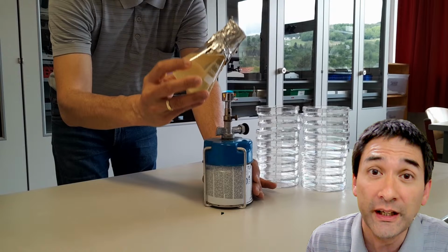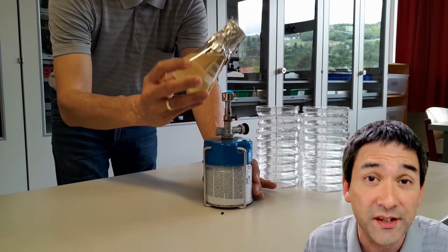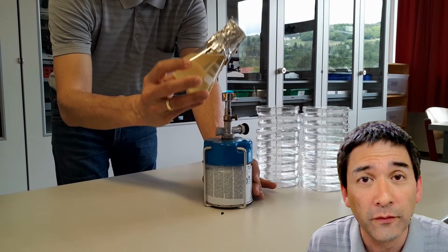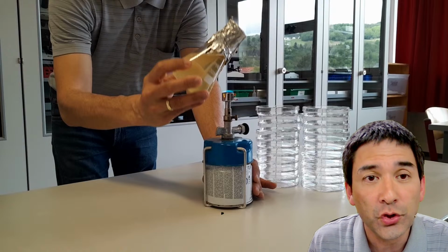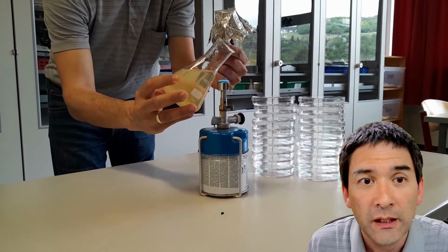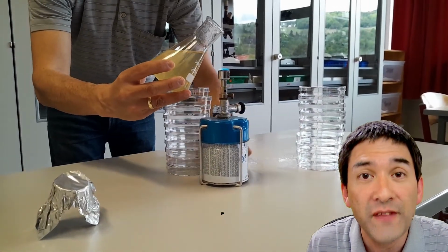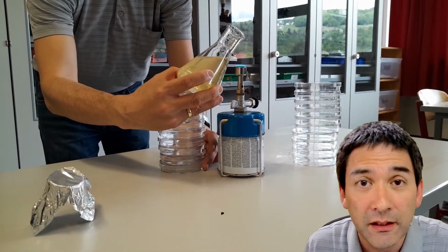And this pressure cooker kills off all bacteria. It's heated up to over 120 degrees centigrade under pressure. What I'm doing right now is holding the top part of the flask over the gas flame to heat it up. This will also create a hot air cushion. When I remove the aluminum foil cover, because the top part of the flask is very hot, it creates a hot air cushion which prevents contaminating bacteria from the air from falling into the flask.